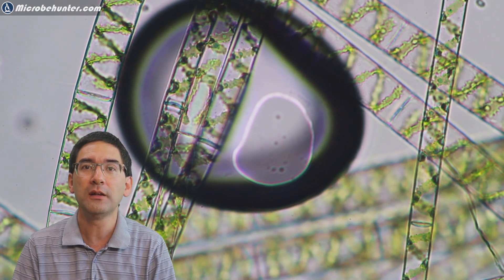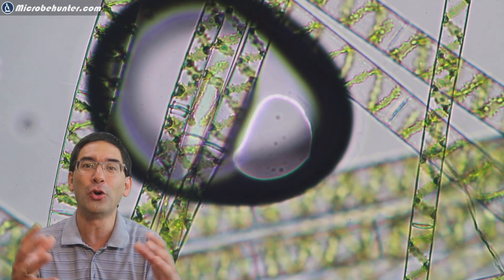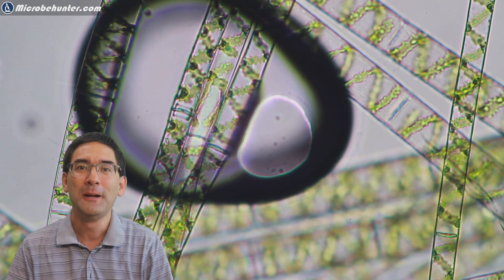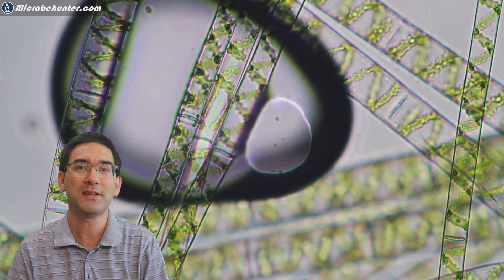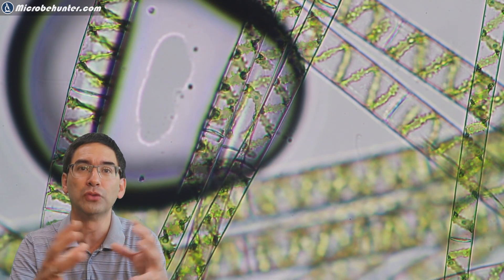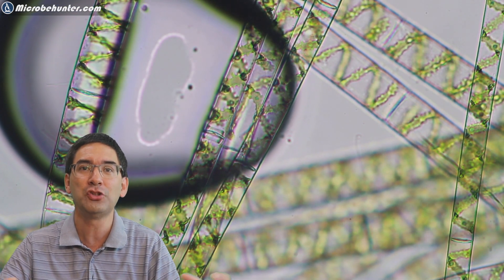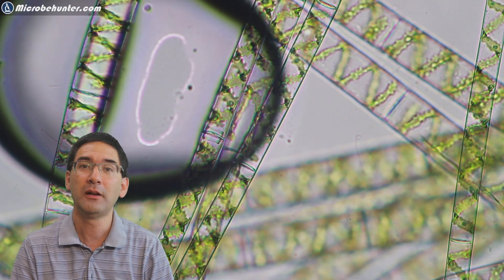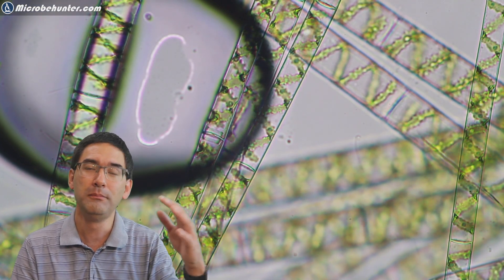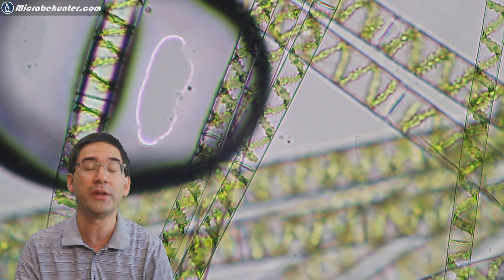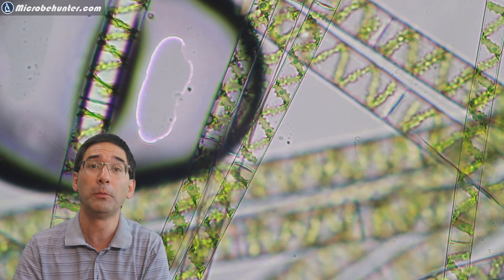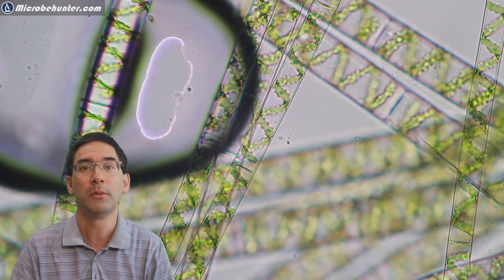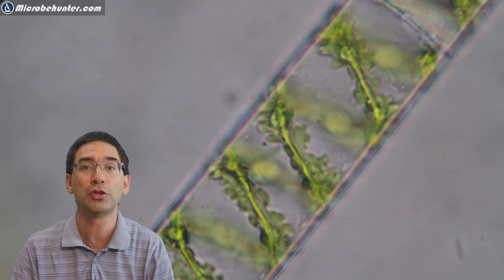So I've been essentially watching the growth of this oxygen bubble for quite a bit of time, it's around 20 times faster time lapse and you can see as the oxygen bubble grows it pushes all of the algae to the side. Now imagine that billions and billions of these algae do that, I mean that's a lot of oxygen. If you can even see it under the microscope the growth of this oxygen bubble, just imagine how much oxygen is produced by these algae worldwide.